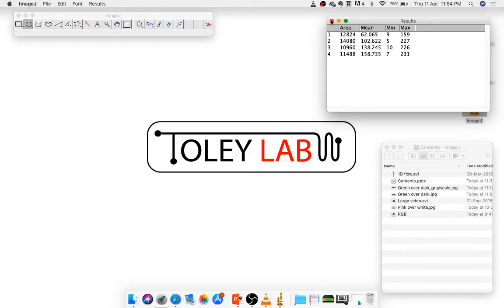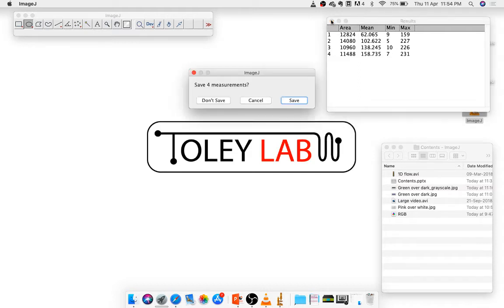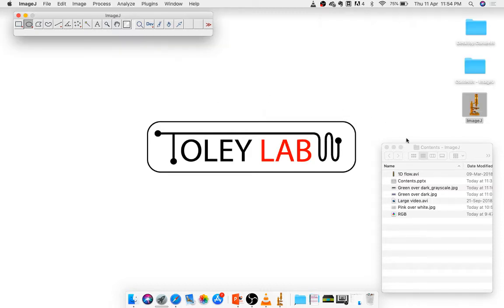There is a different way of analyzing these things where we do a plot profile and an area under the curve, but that is probably something I'll cover in a different tutorial. It's only used where you want to be more particular about what you're doing. By the way, those numbers that just emerged in my Analyze Measure can simply be copied and put into an Excel sheet for further analysis.